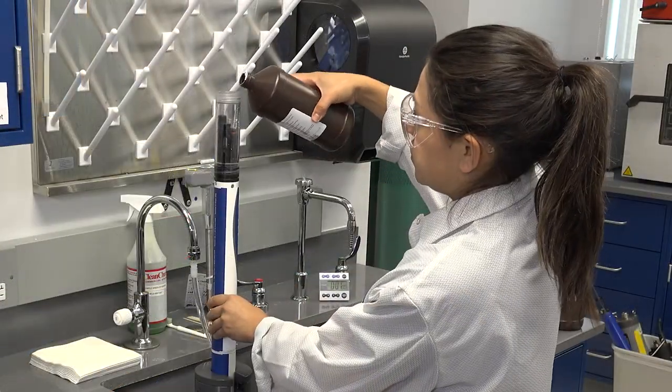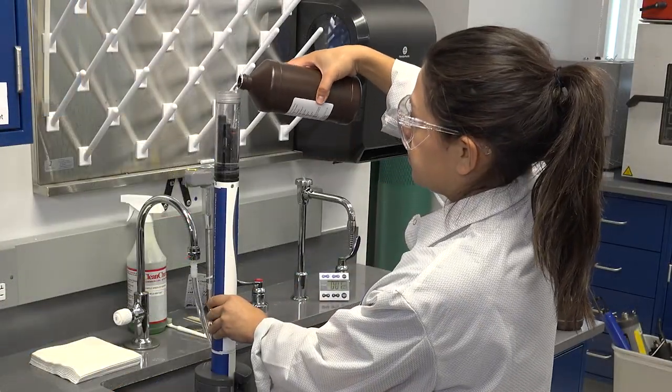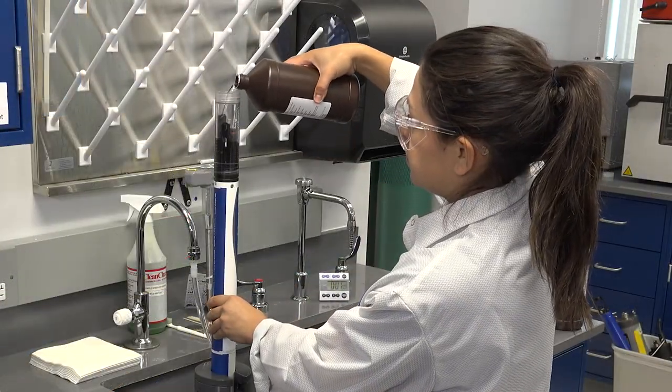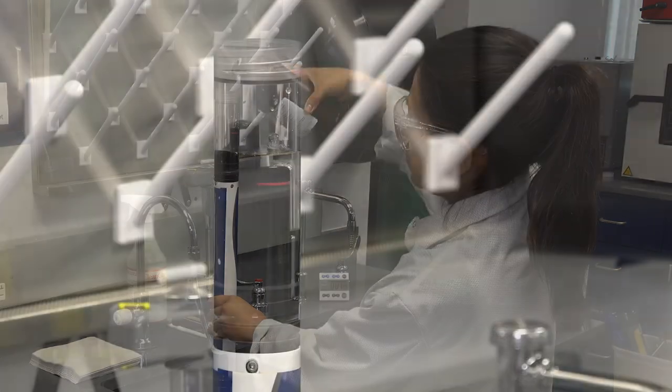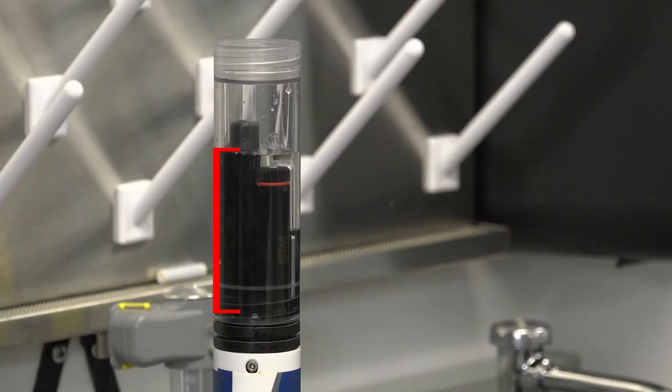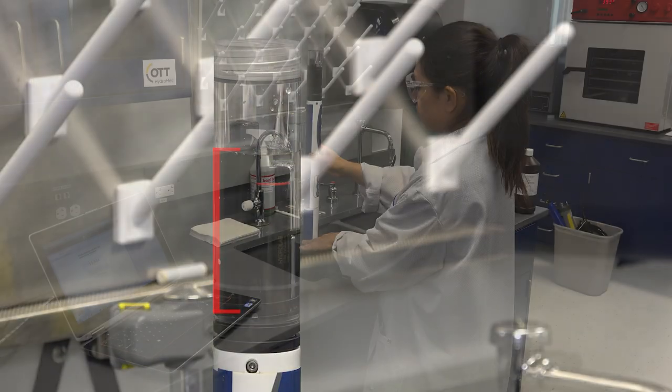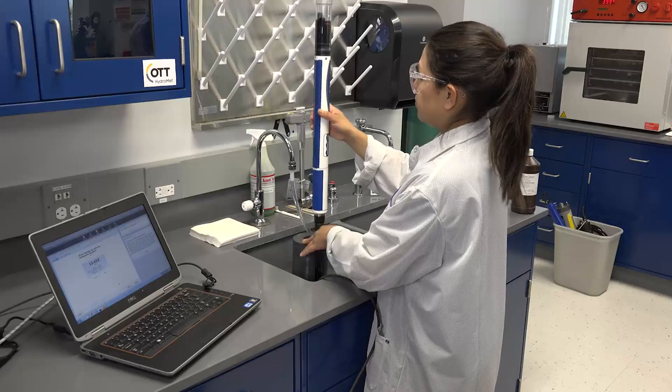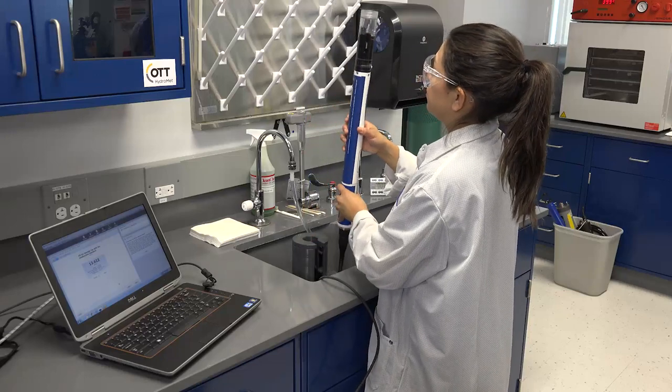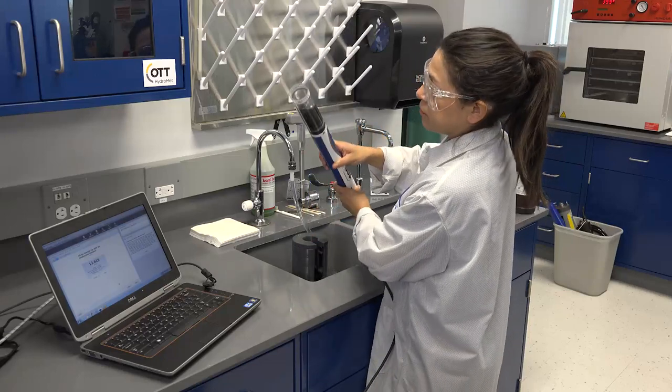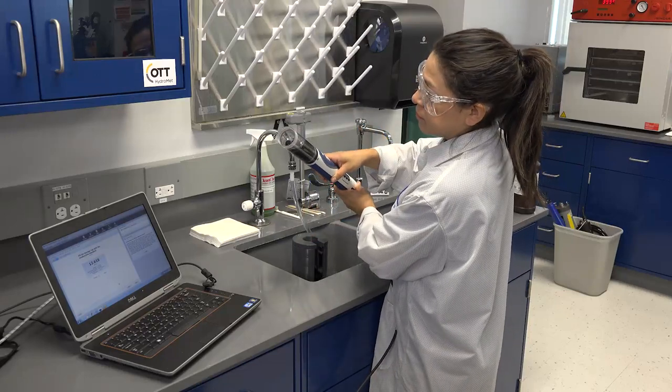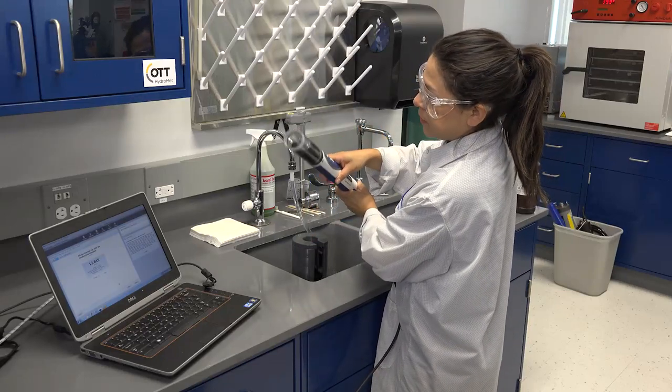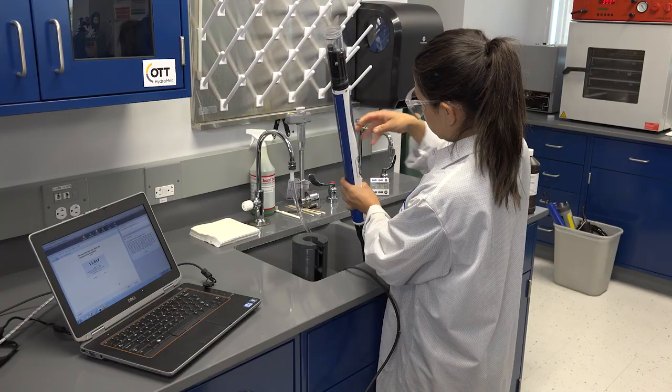Fill the storage cup up with conductivity standard, making sure that the oval hole in the conductivity sensor and the temperature sensor are completely submerged in standard. Be sure to check that there are no bubbles inside the conductivity cell, as these will interfere with the measurement.